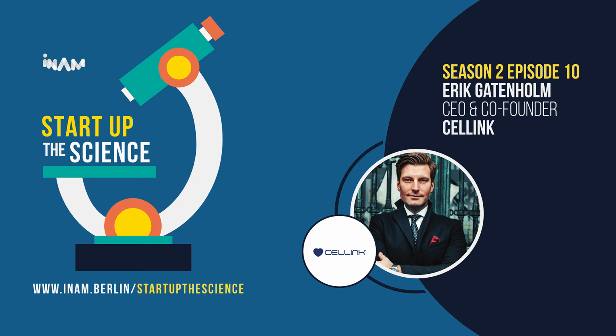So what he did is he took a regular paper printer and he emptied the cartridge, he emptied out the ink, and then he put in human cells instead. And then he wrote his initials on the computer, so TB, and then he went ahead and pressed print. And the printer went out and it started printing, and it printed out the initials with the human cells. And that was essentially the start. So it's a really, really cool beginning of this entire industry. And since then, this industry has grown tremendously. So from those early days when he essentially invented this, the industry has now become mainly focused on developing these printers that are specifically now designed to print different tissues and different cells.